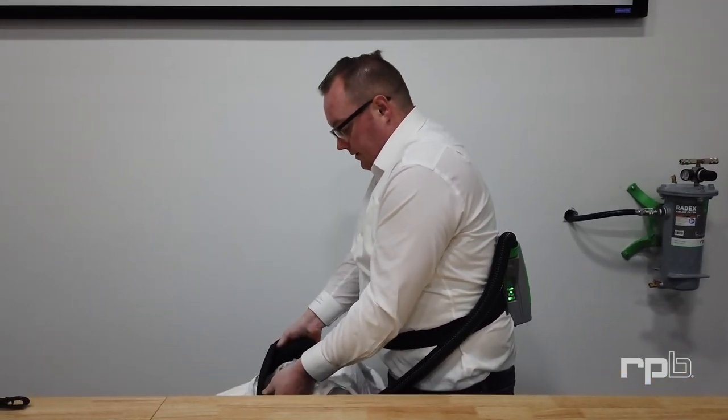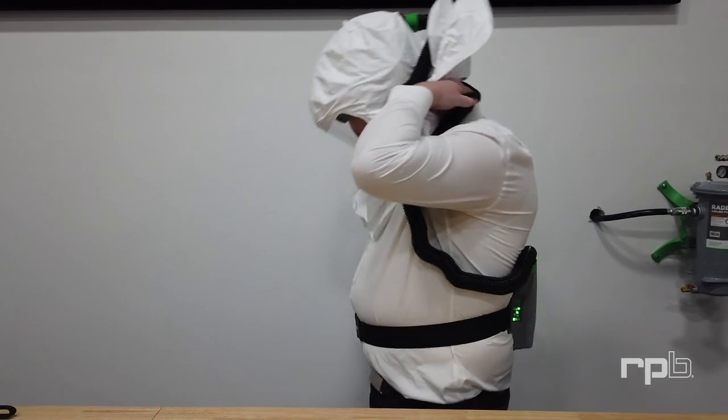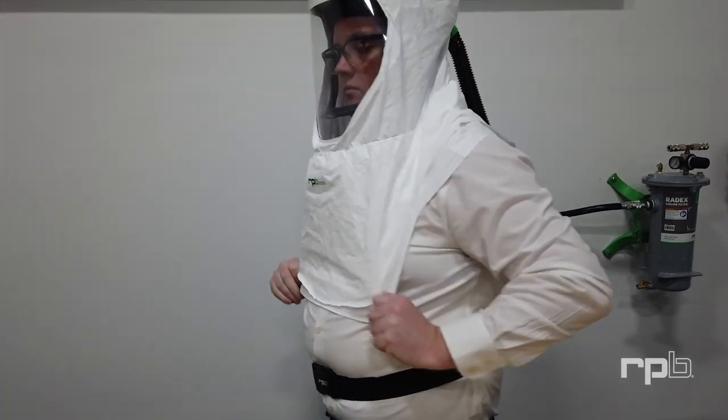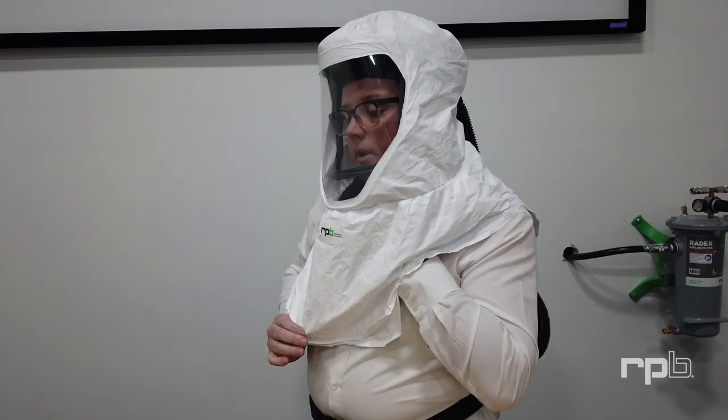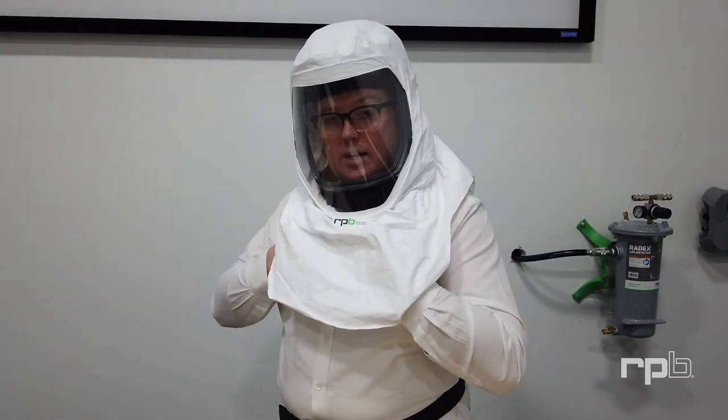Once you've got the black collar, hold on to it and lift it up, over, and into position on your head. Once it's on, reach up underneath it and adjust the head suspension to ensure it's snug. You can also tuck the inner collar into your gown or suit as needed. The outer collar will hang over the top of your suit, ensuring that nothing can get down inside.